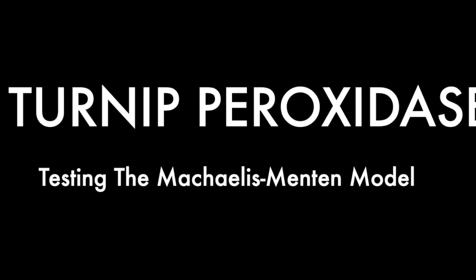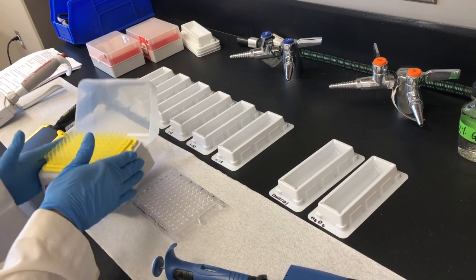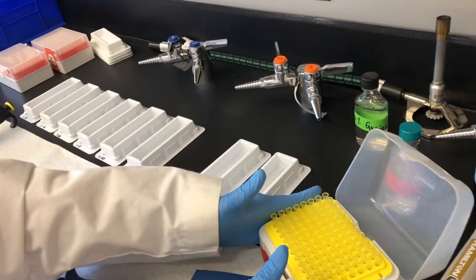Today we are going to demonstrate how to perform the turnip peroxidase lab in 96-well plates. First, we will demonstrate range finding with all the materials listed in the lab handouts.